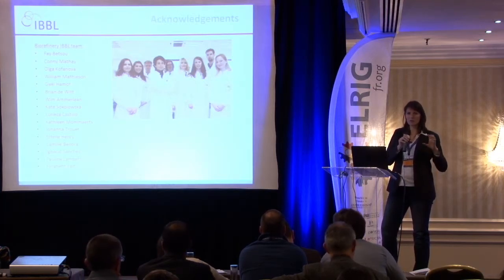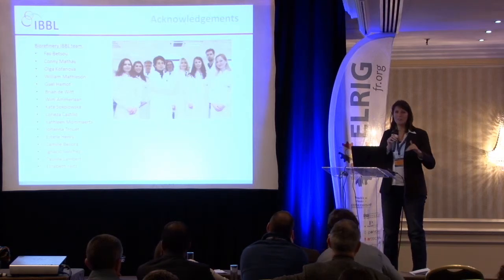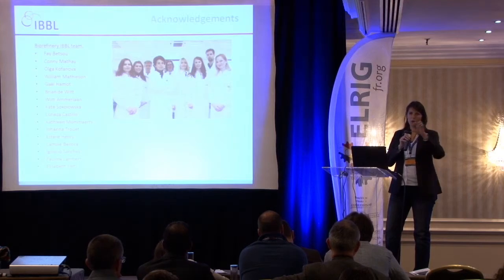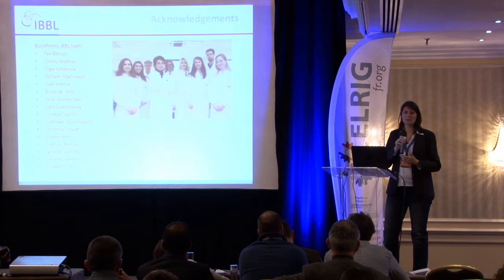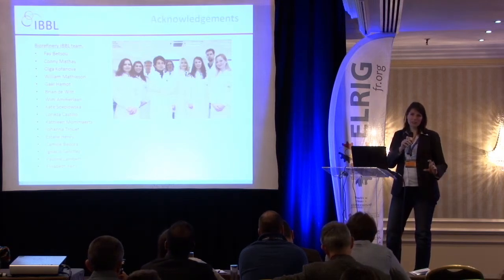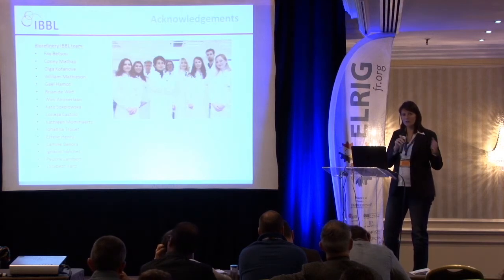But then we also have a continuous monitoring of our results. For example, for DNA extractions, we continuously have the quantifications and the DNA purity results. We always plot them in graphs, and we see if there is a trend which decreases. But for the proper method validation, yes, it's mainly comparing in several replicates, in several studies, by different operators, manual against automated.